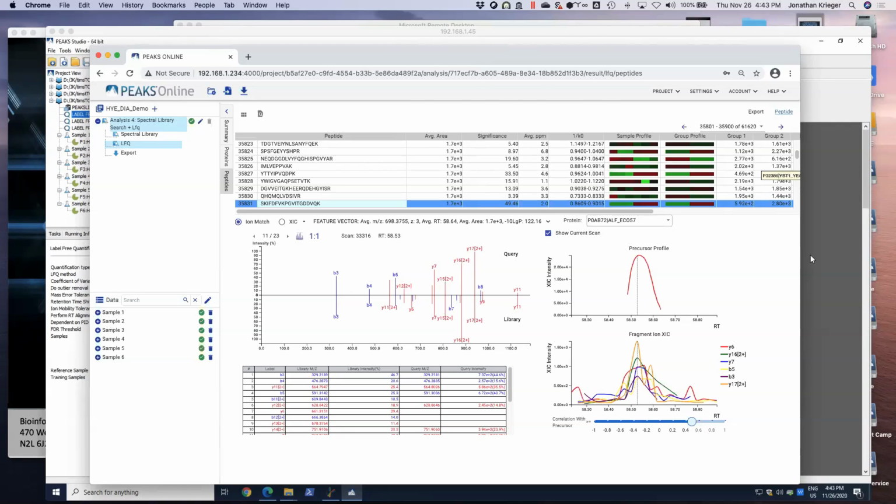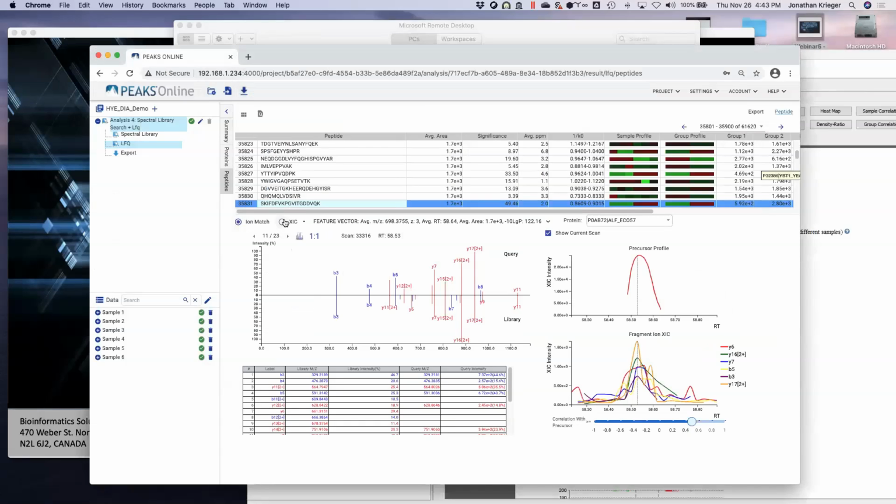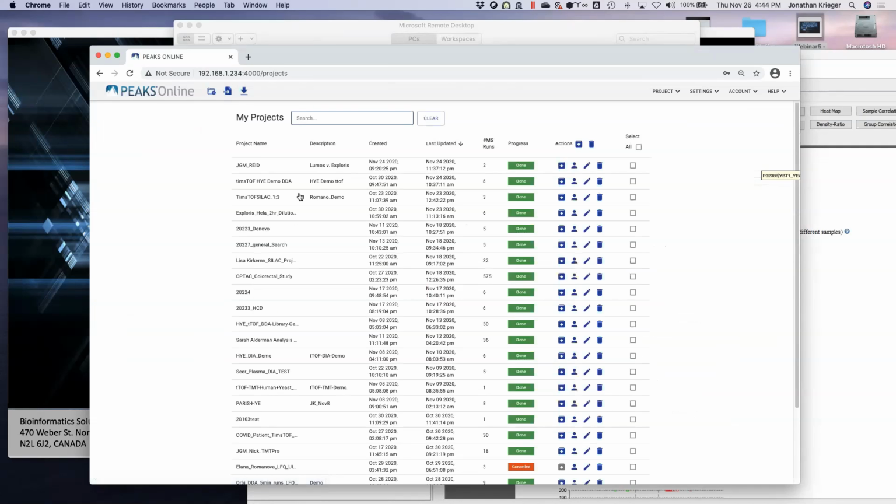And so what that really means is, in the older versions, if you looked at the spectrum of a timsTOF file, instead of these ions that we're picking on the centroided data, you'd see the multiple centroided data filling the MS2 peak, kind of like profile mode. And so it cleans up the data quite a bit using the Bruker SDK. And so you especially see that in the DDA data.